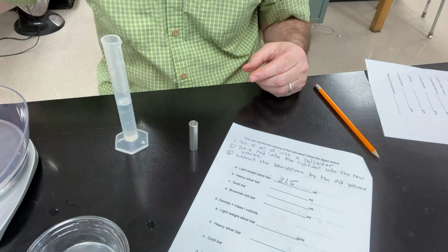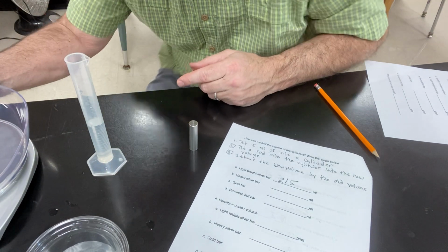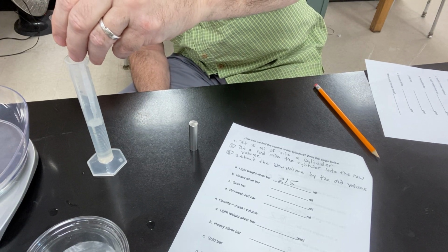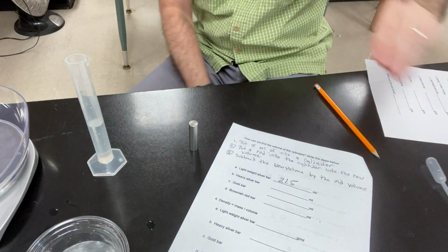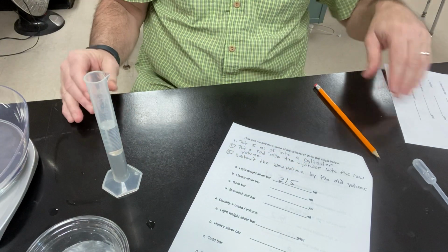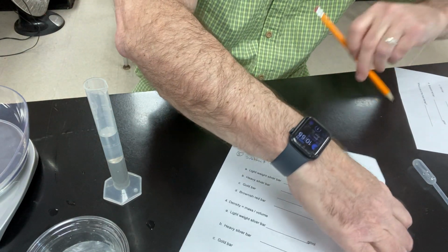Woo! Pretty close. And you got to get your head on it to make sure that you're right. And I'll use my dropper. I put it in just a smidge too much. There it is. Put that back in the cup. Put the silver bar in, slide it gently, no splashes. Amazing, amazing. Oh, and it's 21.5 again. How about that?